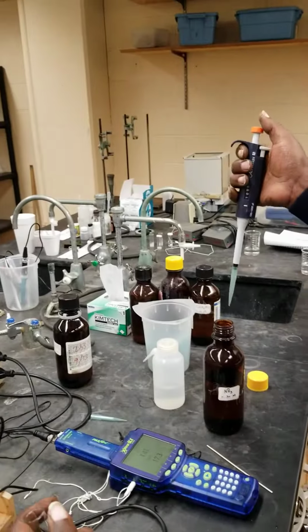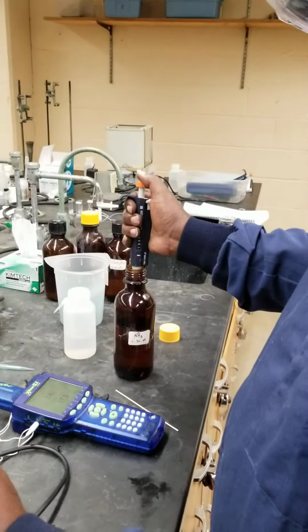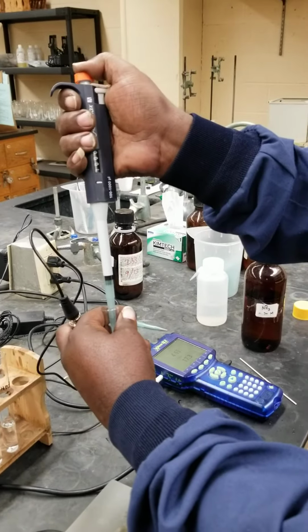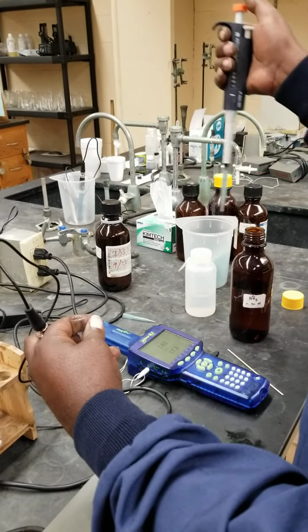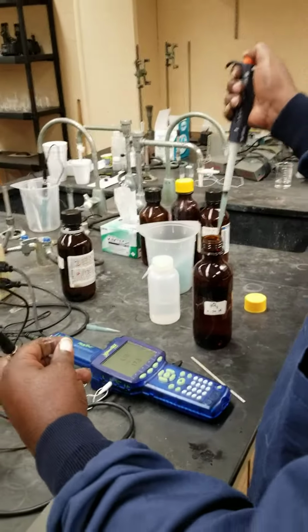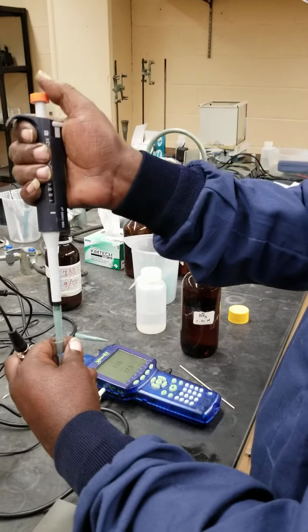Adding ammonia now. One. Two. And three.